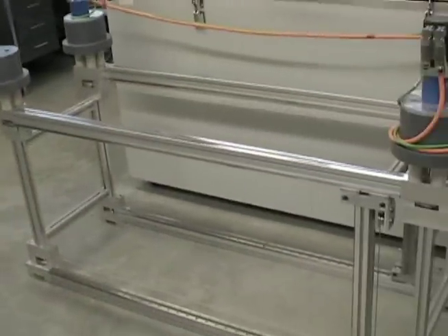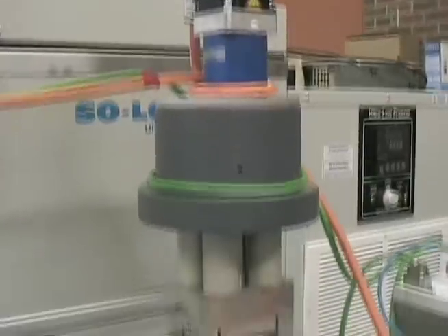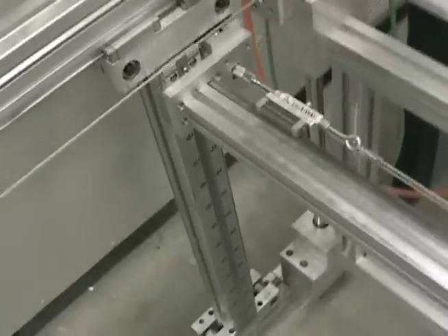The motors that drive the robot are located outside of the freezer, so no heat is added to the system from the motors. This is also less taxing on the motors.